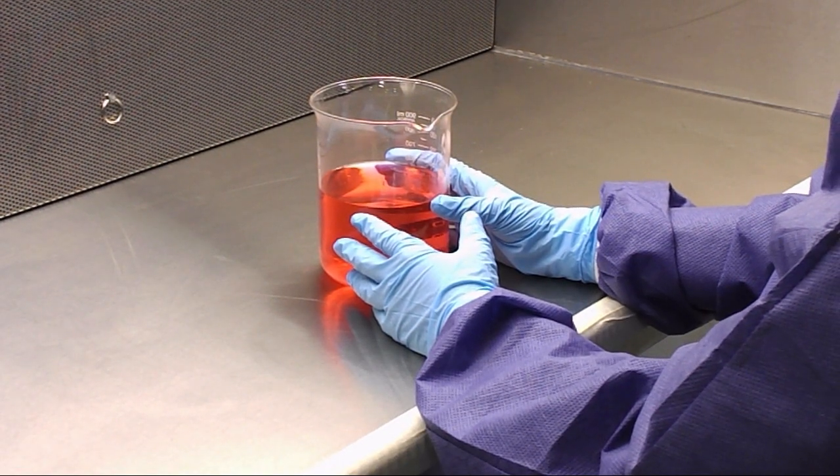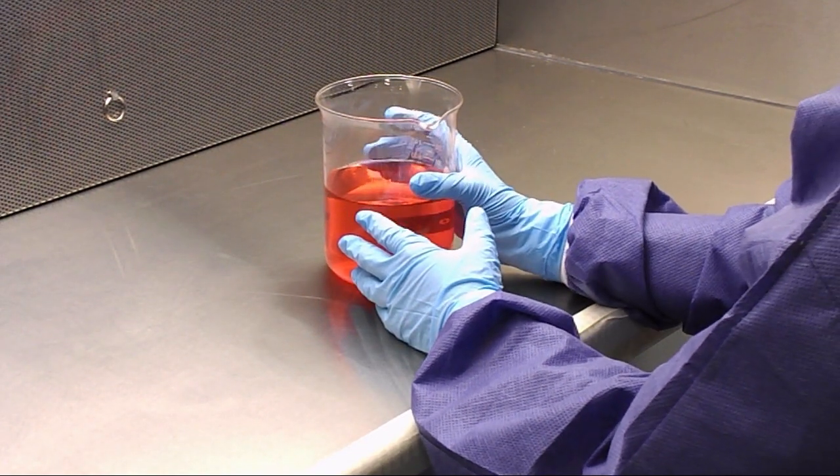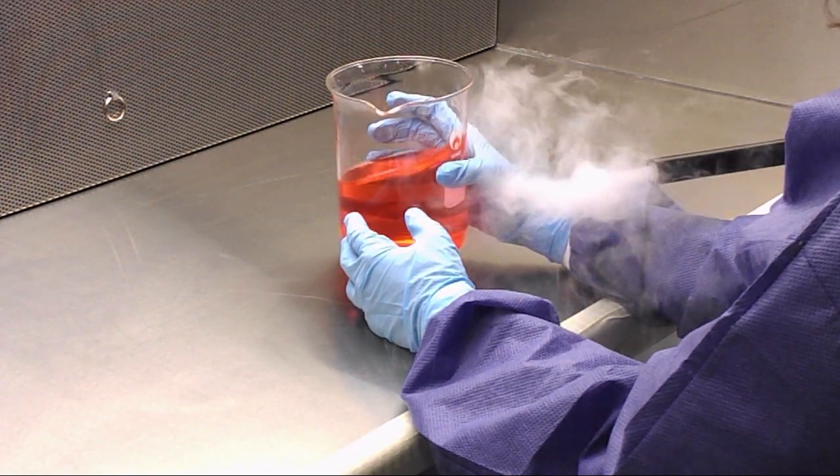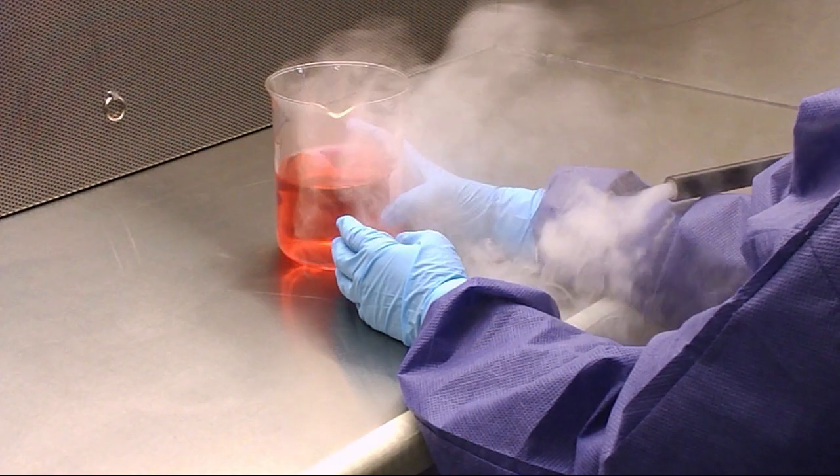This smoke demonstration shows what typically happens in other clean benches when turbulence is created in the air just outside the work surface. As you can see, room air is able to enter the work area, bringing potential contaminants with it.